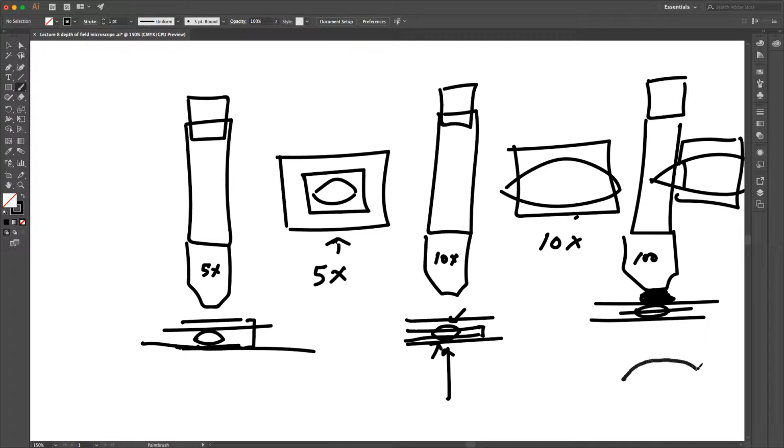So when you're focusing the microscope, what you're doing is moving the stage up and down, closer or further away from the microscope objective. So you could focus on this part of the cell, and so whatever was here would be perfectly in focus, and then there'd be other elements down here that are out of focus, and they ultimately are part of your final image as blurry light in your image, which makes it less sharp, obviously.